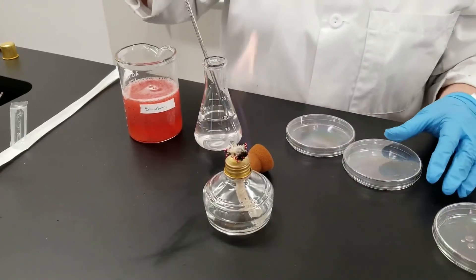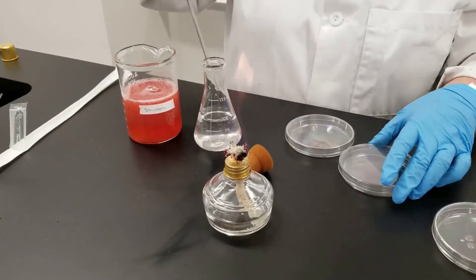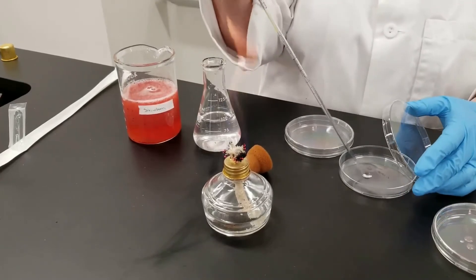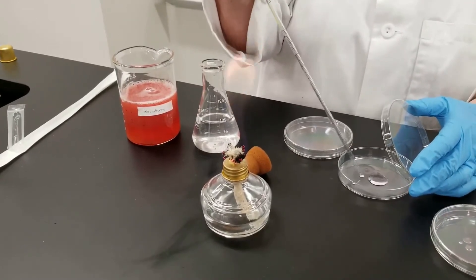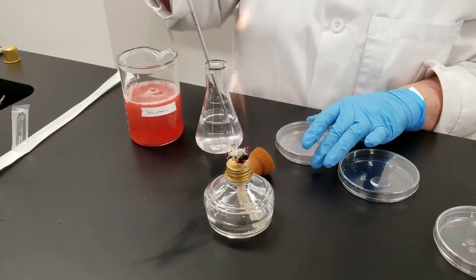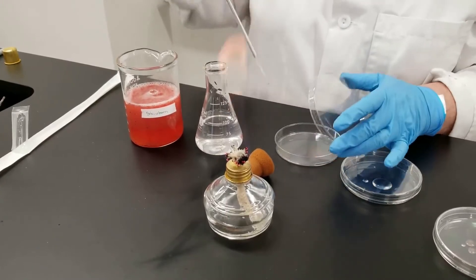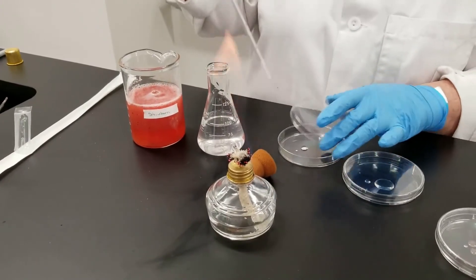Take a milliliter out, put it into plate number three. And in the last plate, plate number four, we're just going to take a tenth of a milliliter out. So this way we will have four different dilutions.